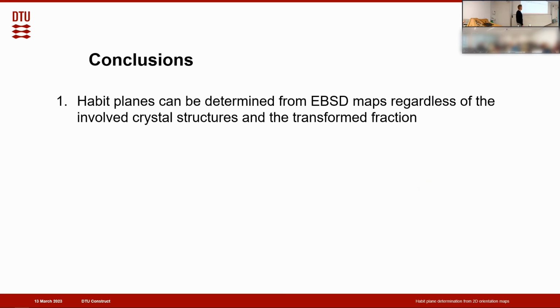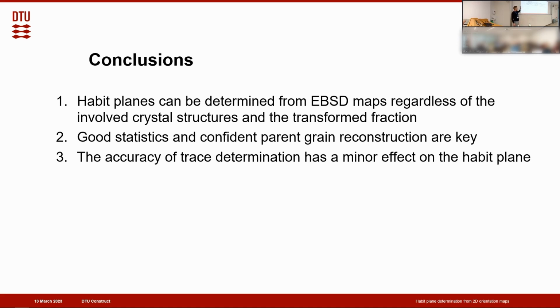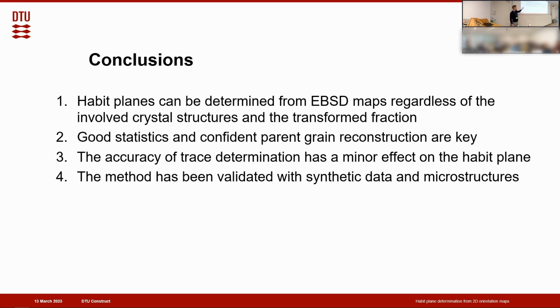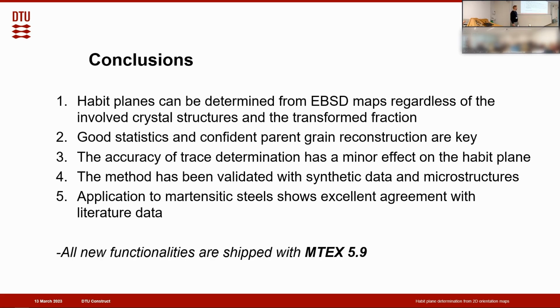To conclude the talk, habit planes can be determined from EBSD maps, regardless of the involved crystal structures and the transform fraction, which is a novelty. Good statistics and confident parent grain reconstruction are key for this. The accuracy of trace determination has a minor effect on the habit plane, which was a little bit surprising to us. The method has been validated with synthetic data and synthetic microstructures. And we also applied it to martensitic steels, which shows excellent agreement with literature data.